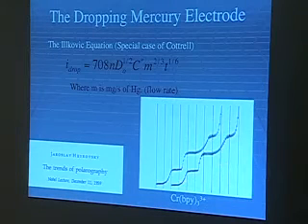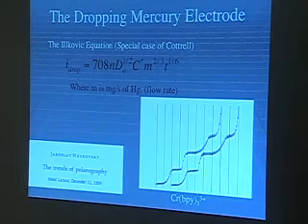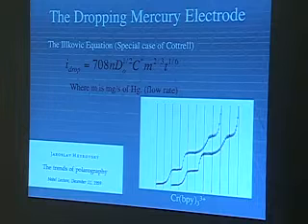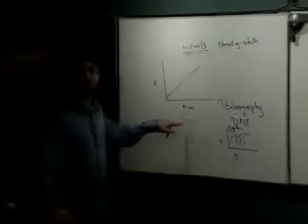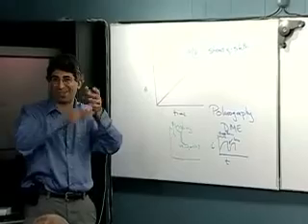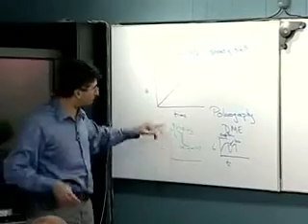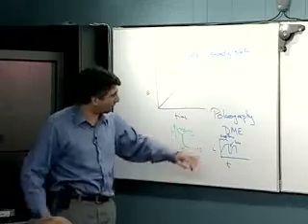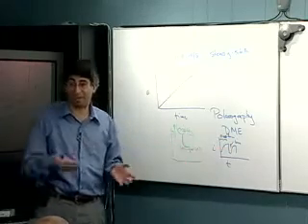Now, one way you might refine this, it turns out, because I've tried this, if you do things this way, and probably Heyrovsky was good at it, but I can't come in on 2 separate days and get my reservoir to exactly the same height. You know, this is just on a ring stand, which is more or less what Heyrovsky was using also. Have exactly the same height, so I get exactly the same drops per unit time and size drop and whatnot, and reproduce my data from day to day.